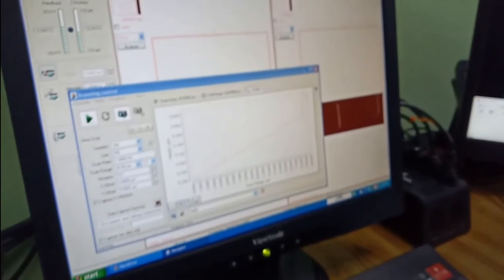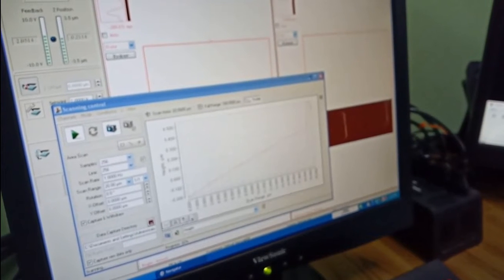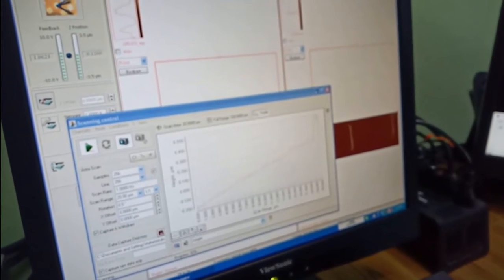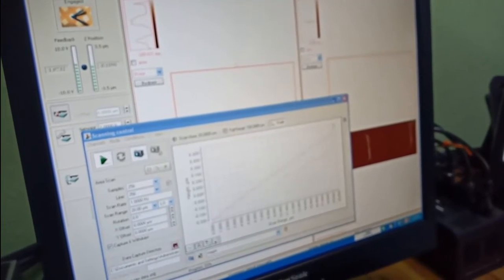After a few minutes, we can achieve a very good image of our sample, and also an image with very good characteristics in topography, roughness, and we can also make measurements in the nanoscale. For this part, this was only a commercial sample, but we can observe anything we want depending on the adjustment of the equipment.